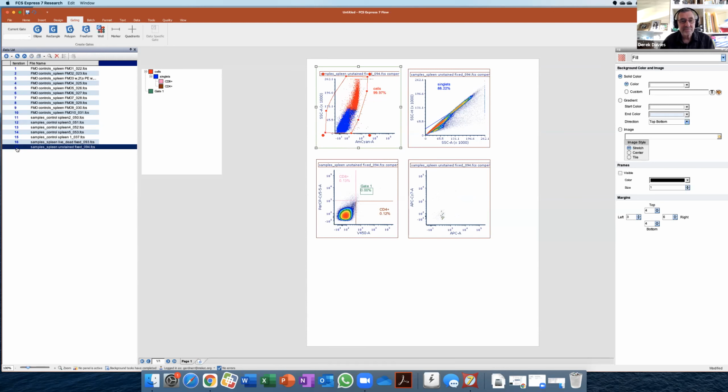Right. So you could be tempted here, for instance, to pull it down in the unstained. You see that we're not capturing the spread. We do have here a bit of, probably dead cells. Well, we don't have a dead cell marker in there, do we? Oh, right, exactly, this is the unstained. So those are a few autofluorescent dead cells sneaking in there, I think. Exactly. And you could be tempted to do this, and you're not capturing the spread. Here, it's not a big deal for the CD4 because we don't have that much spillover.